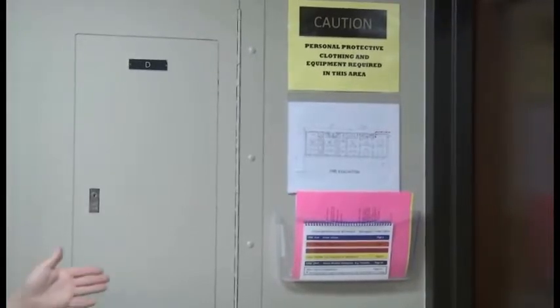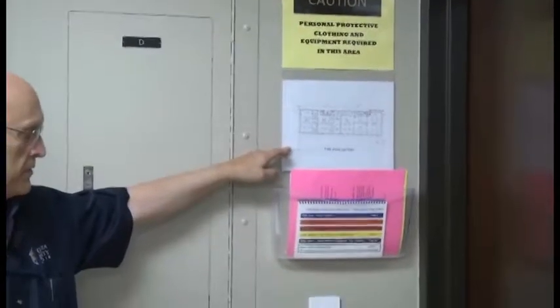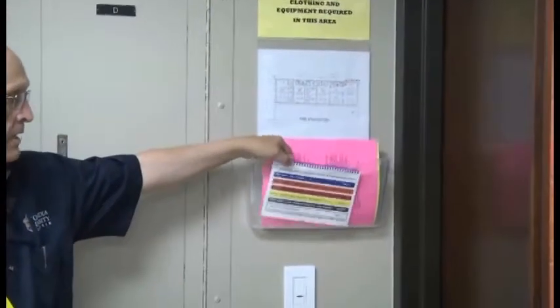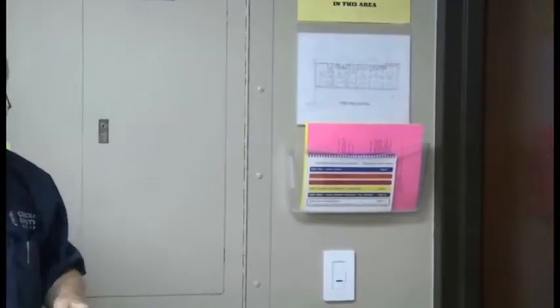Some of the other things that you will find in here, obviously, is an escape route to get out of the building in case of a fire or an emergency, and our response plan. But then there's also a couple other items in here. One of them is, if you're in a lab and you break something and you cut your finger, to that effect, you want to fill that out. You want to have a record of that. So you fill it out, give it to your professor in the classroom or the training assistant.